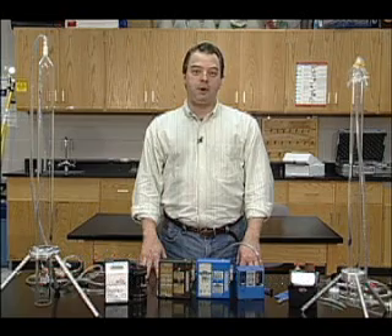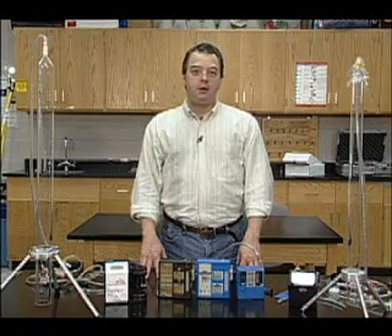Hi, I'm Gary Brown. I'm a certified industrial hygienist and a professor at Eastern Kentucky University, Department of Environmental Health Science. Today we're going to talk about calibrating a sampling pump.